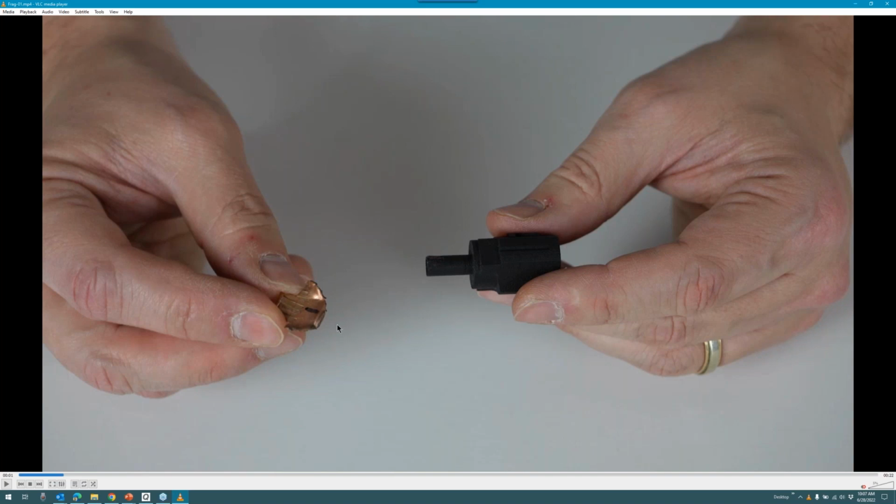What you want to do beforehand, though, is get familiar with what is on that surface. And so as you're cleaning the surface, typically with acetone and the cotton swab, get yourself familiar with what is taking place on the side of that jacketing fragment. And in this case, I know there is a single land engraved area that I can acquire. And so the region I intend to traverse here during the acquisition is going to be from just before that top shoulder to just after the bottom shoulder, the driving shoulder, trailing shoulder. I want to cover that distance in the region of my acquisition.